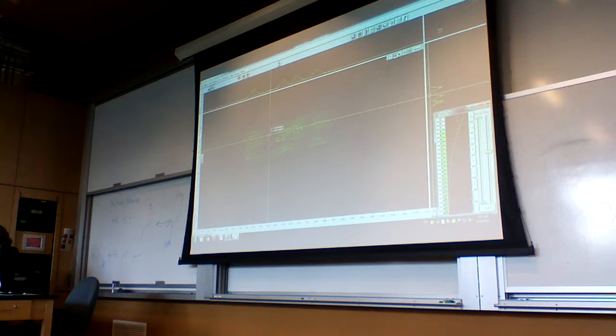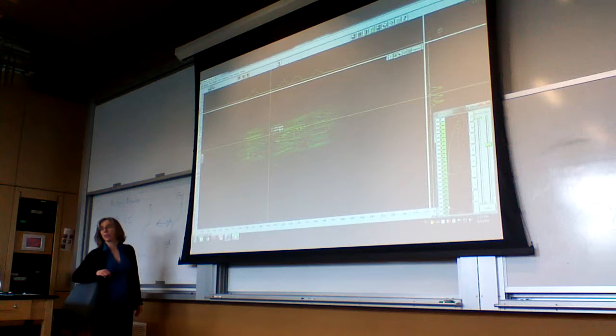If I get too much signal in here, or not enough signal, so if I take away some of this, we actually do see that. It's pretty strong coupling, so you see that. But if it's a weak coupling, you may not see it in the COSY. And if you get too much signal, then it just looks like a big old blob. You have to be careful with that too.